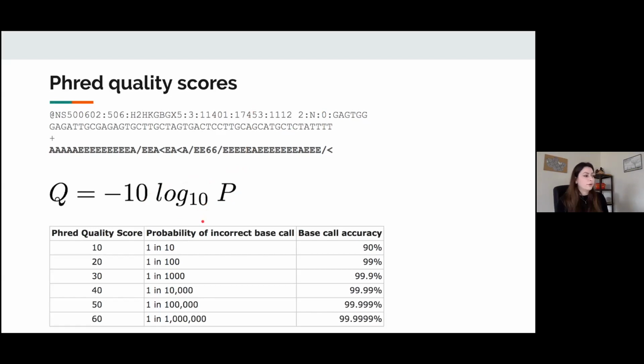It has a straightforward meaning. The sequencing instrument is making a call for each of these bases, and it's reading the information that it got from the visual call and saying, what's the most probable base that was read at this point, and it decides it's a G. So it's telling you in the quality line what is the confidence that it has in that call.